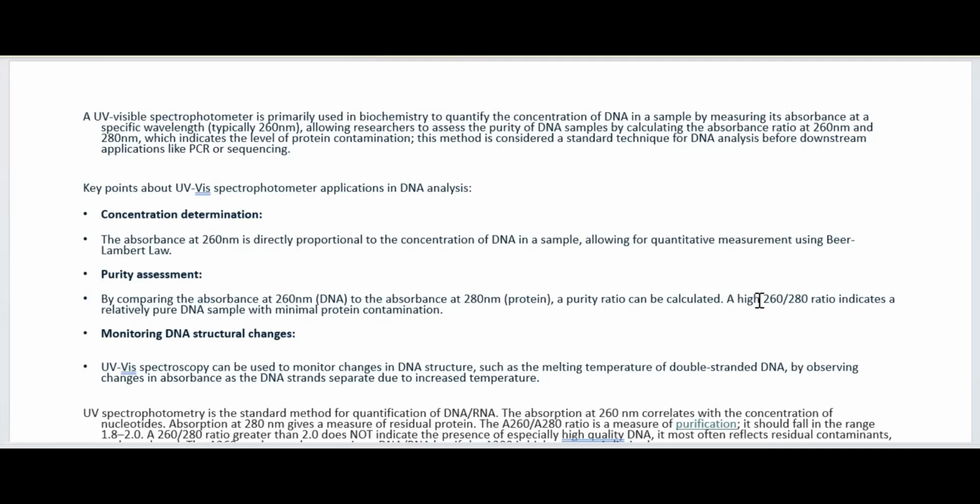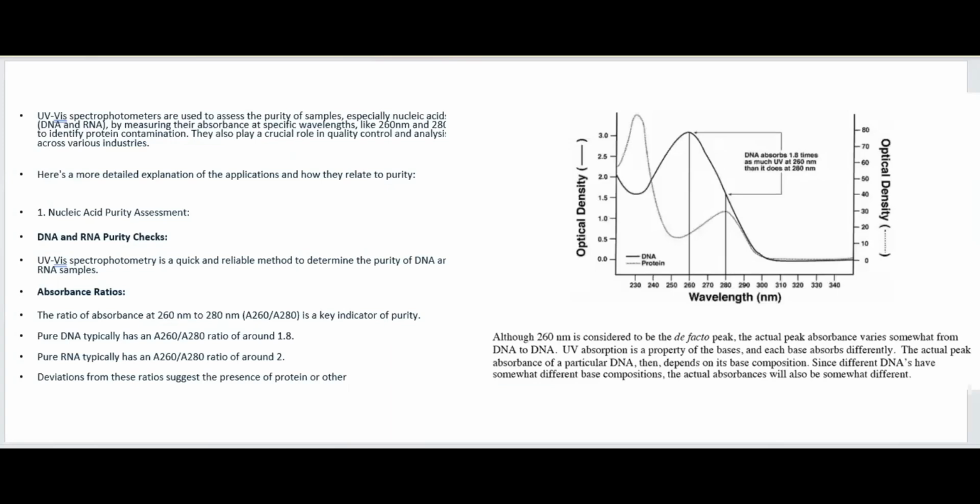Structural changes in the DNA can be monitored. So these are a few examples when we talk about use of spectrophotometer in study of nucleic acids. Now here, when we are talking about purity, you can take this slide as a description for whatever we have discussed till now.